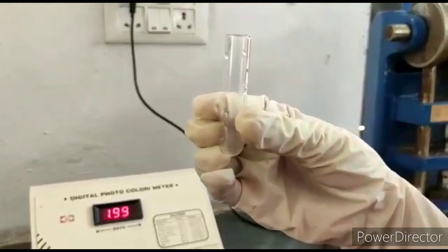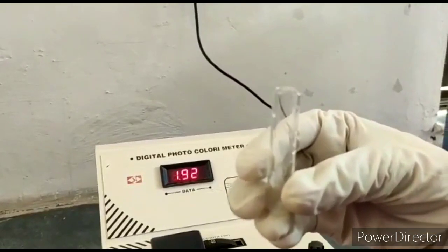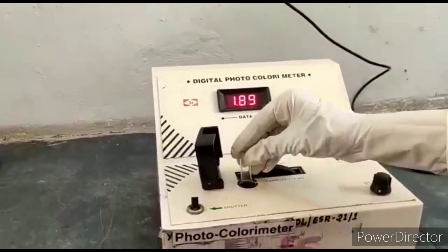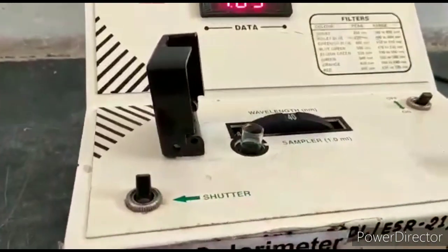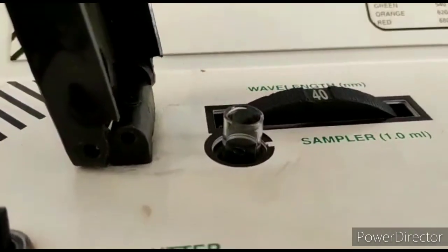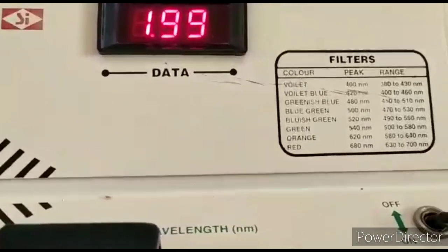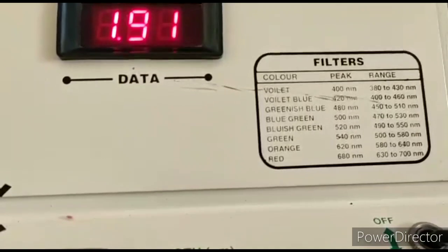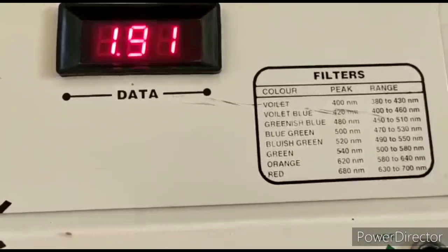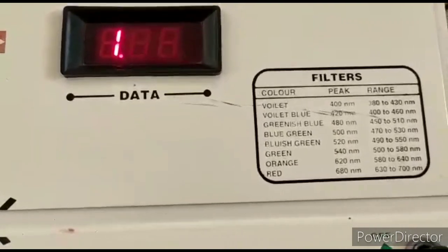This is the photo colorimeter — plug in the switch and switch on the colorimeter. This is the cuvette used in the colorimeter; it has a capacity of 1 ml and has a white mark which is kept aligned with the sampler slot. There are various filters available: 400 nm, 420 nm, 480 nm, 500 nm, 520 nm, 540 nm, 620 nm, and 680 nm.